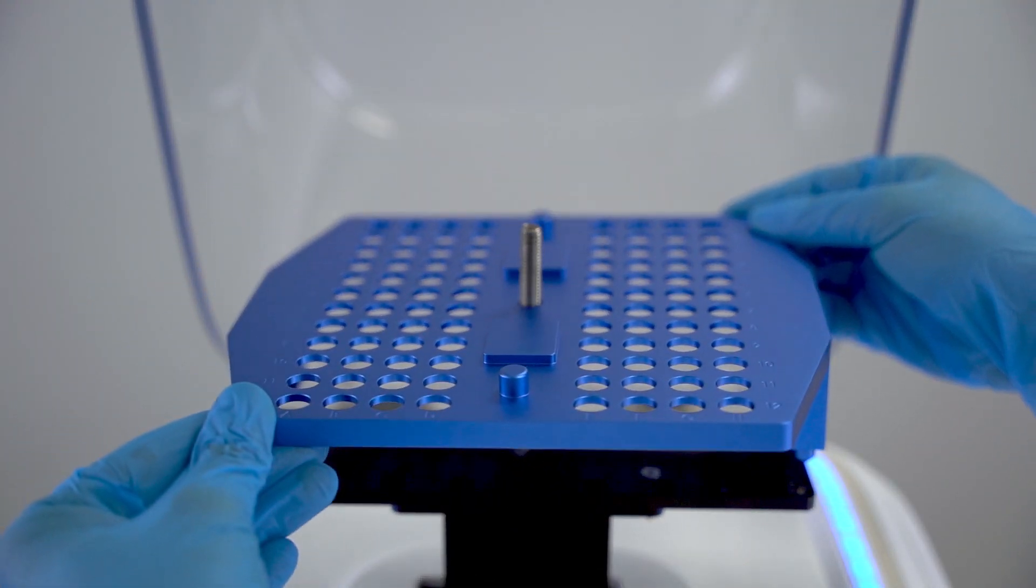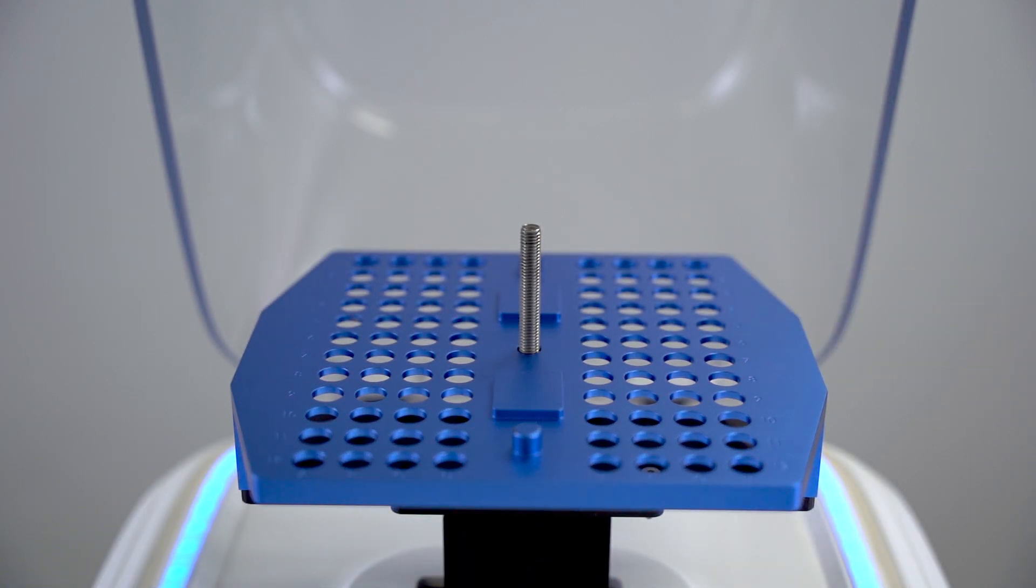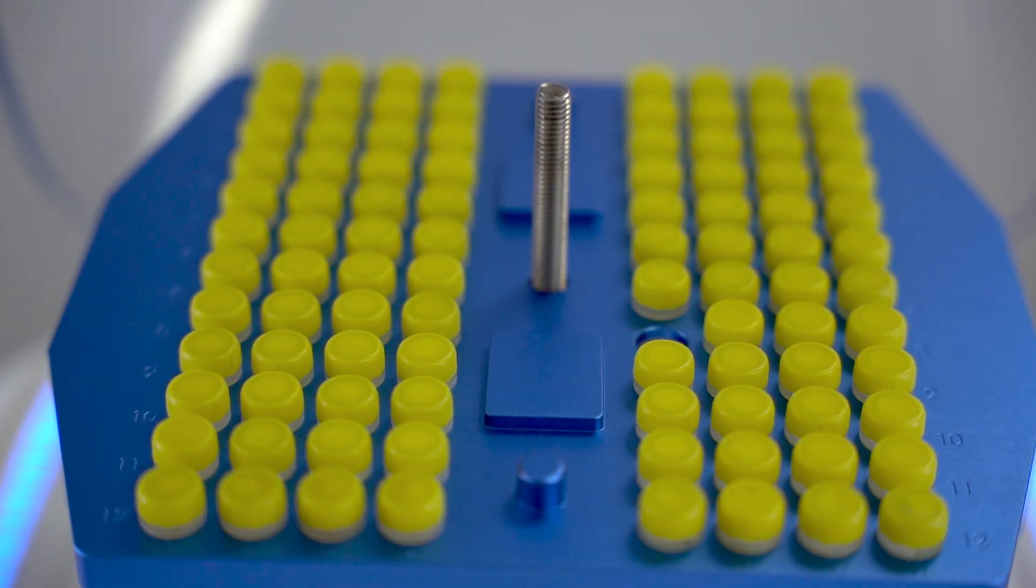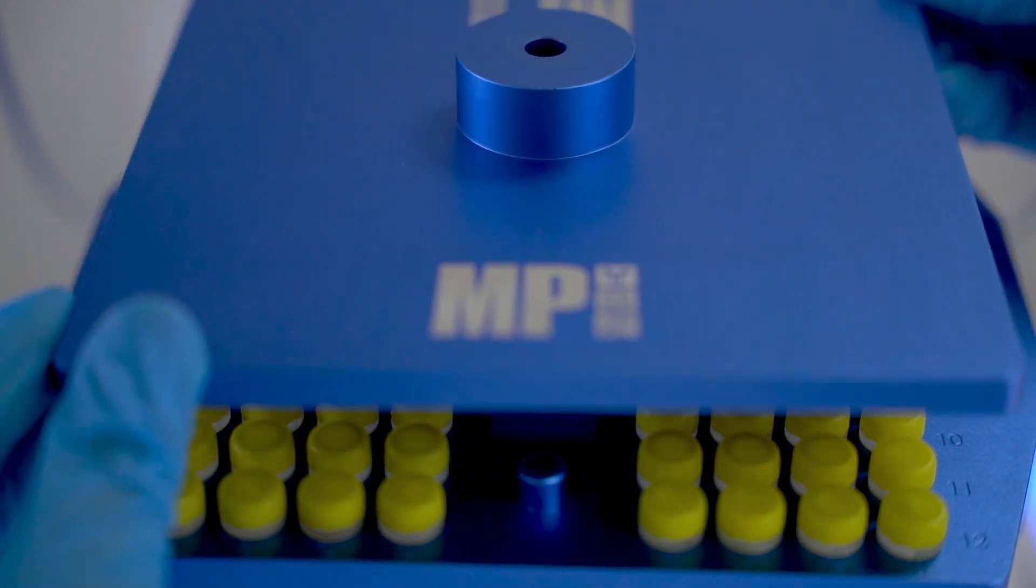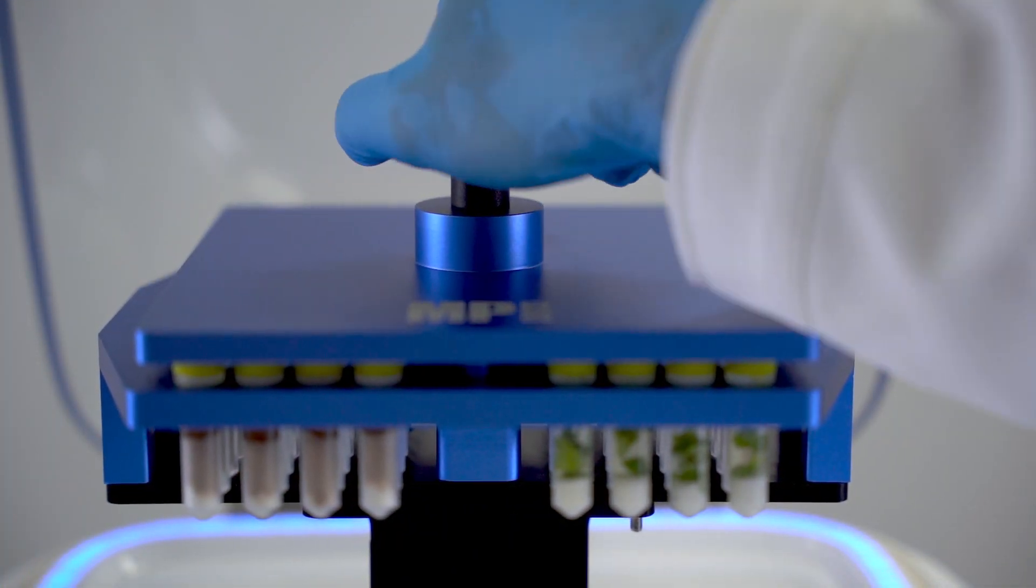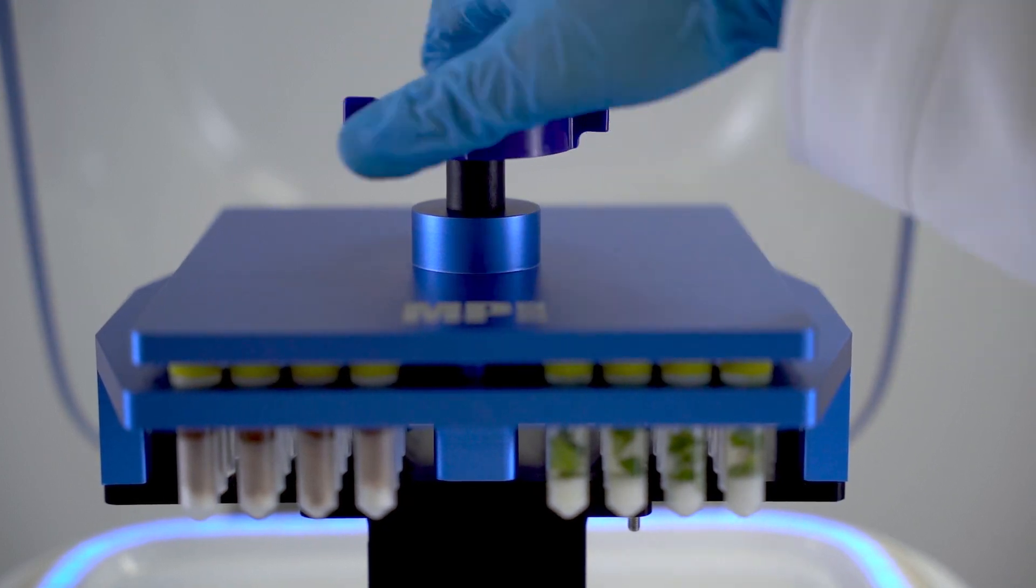Various types of adapters are available for your different applications. Please view them at www.mpbio.com. Load the samples into the adapter and put on the top plate. Place the blue ClickMaster on top of the rod and turn it clockwise until a distinct clicking sound is heard.